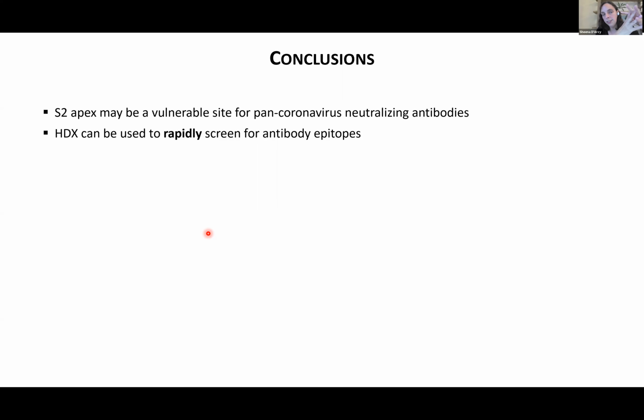And both of those are valid approaches, of course, depending on your specific question and your specific system. But I also want to add that this sort of extra processing of samples after doing the exchange is not uncommon. We have a lot of projects involving nucleosomes, and so we use typical 147 base pair DNA. And over time, if we're injecting a lot of samples, this DNA will really clog up our LC system. So we just routinely run these ion exchange spin columns to get rid of it.